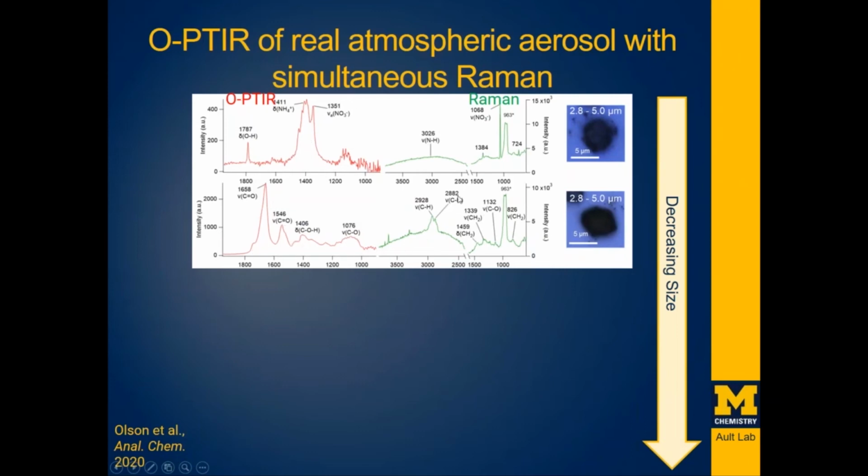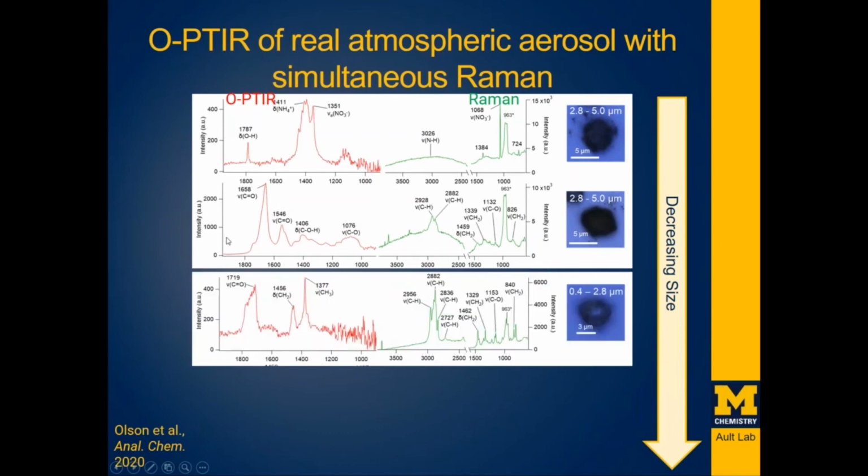Similarly, when we were looking at a spectrum like this for the Raman in the past, we would say, okay, we have some organic modes, but we're not so sure what they are. We have some different C-H stretches, bends, C-O stretch. But once we were able to look at the IR, we said, oh, wow, we've got a really strong carbonyl here, as well as some other modes that are going to help us identify that organic material.